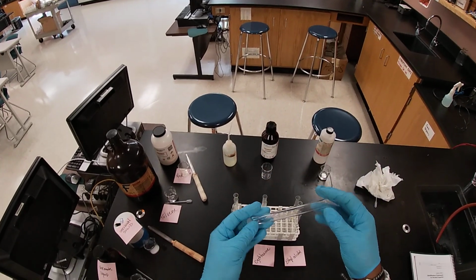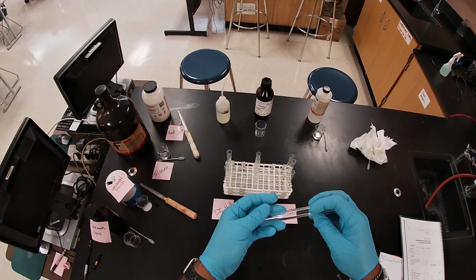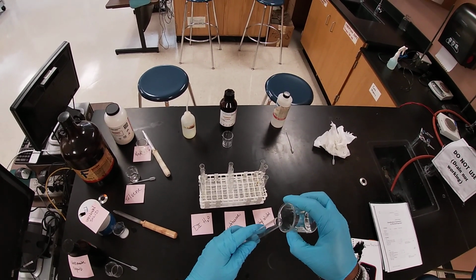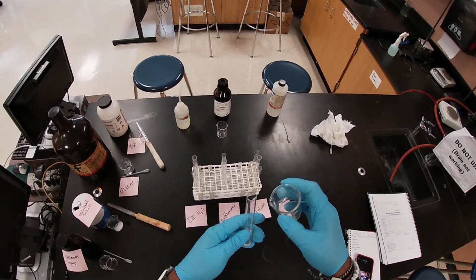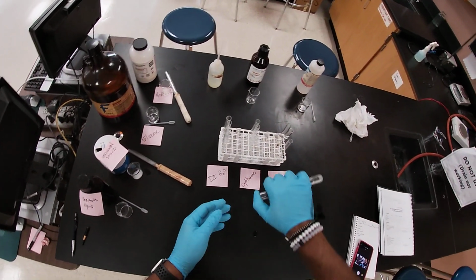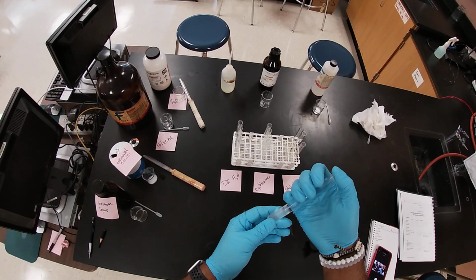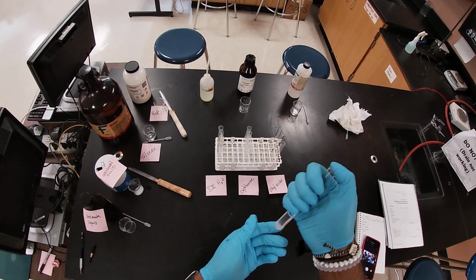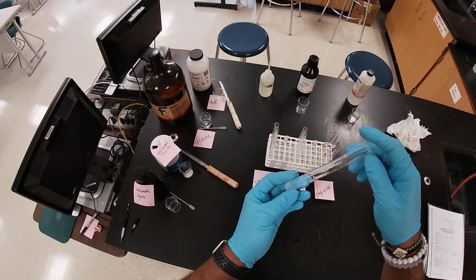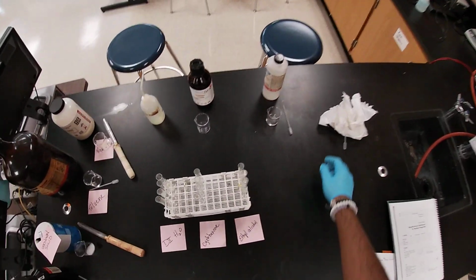And then for ethanol and the salt, or the unknown solid, maybe if we add some more here, let's find out. Let's find out here. No, it doesn't seem like it wants to. There you go. We'll wait a little longer and we'll come back to it, but it doesn't seem like it.